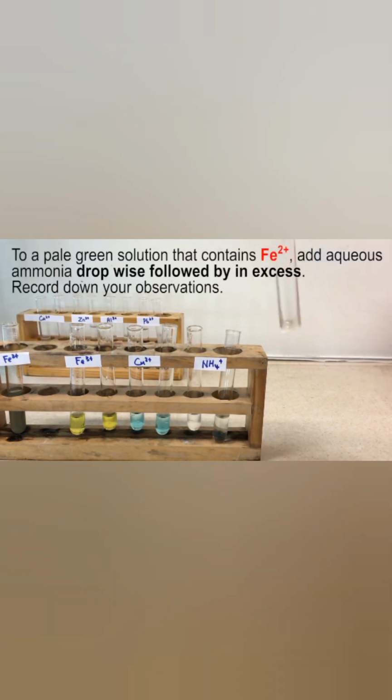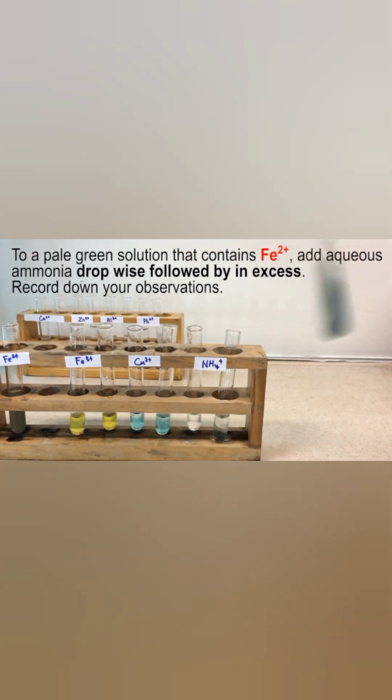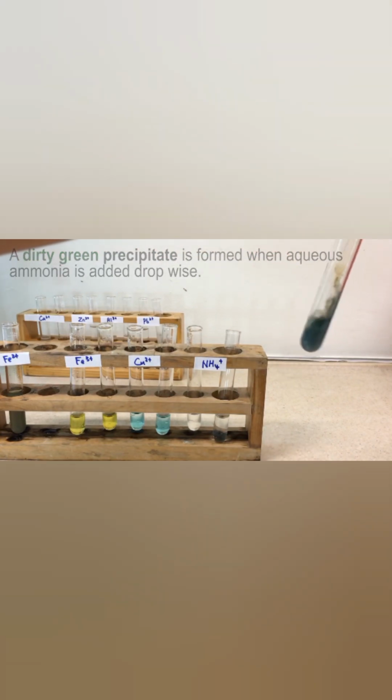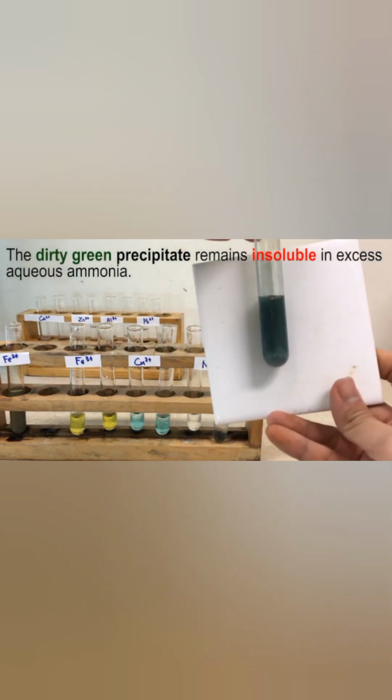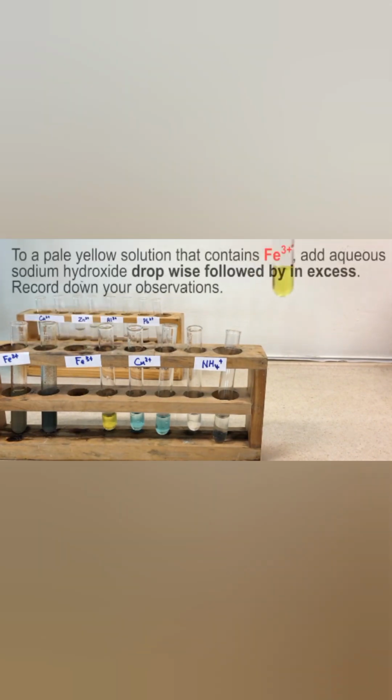Now let's add aqueous ammonia to the same solution of iron 2. Okay, what happens there? A dirty green precipitate is formed when aqueous ammonia is added in drops. The dirty green precipitate remains insoluble in excess aqueous ammonia. In drops, the dirty green precipitate appears, then in excess it still remains.